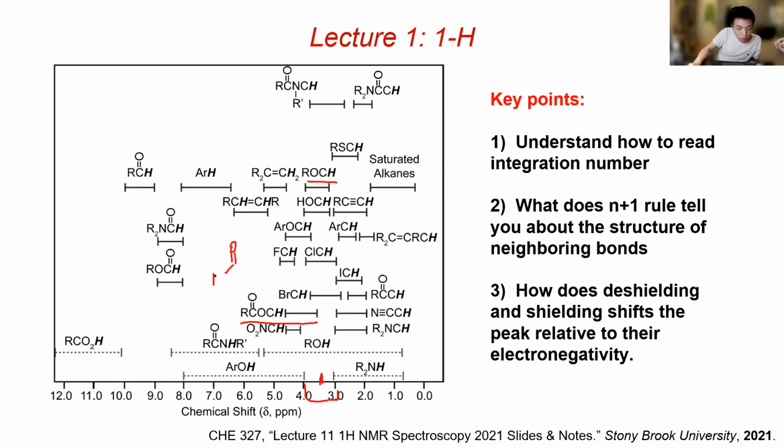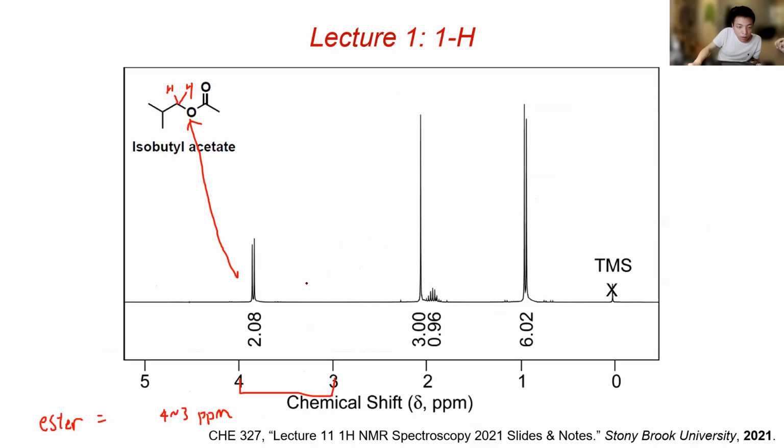And it looks like this, R, O, and this is our carbon. It means this hydrogen. And we have 2 of them. And this peak right here, the 3, is a singlet. It means n plus 1 equals 1, and n is 0. There's no neighbor hydrogens. And the only one here we can see is this one. Because remember, this is just a carbon. There's no hydrogens here.